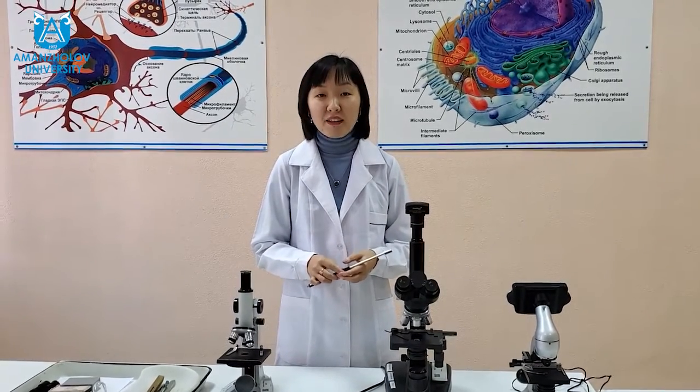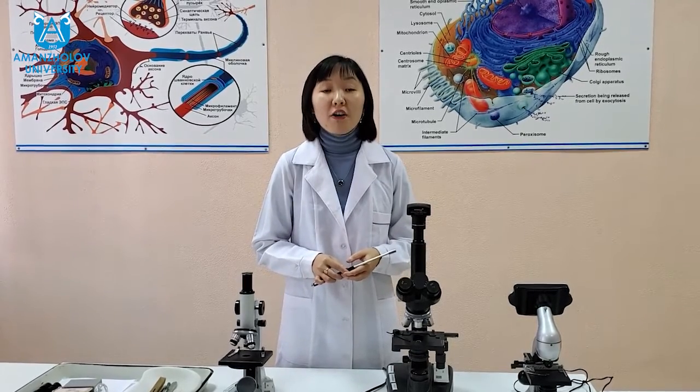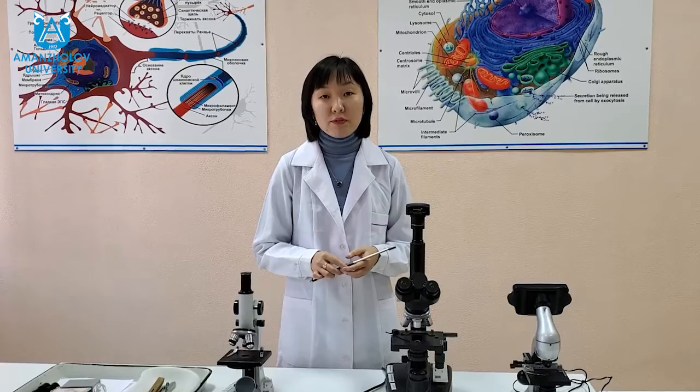From a structural and technological point of view, a microscope consists of the following parts: mechanical, optical, and lighting, or electrical. The first, mechanical part of the microscope.